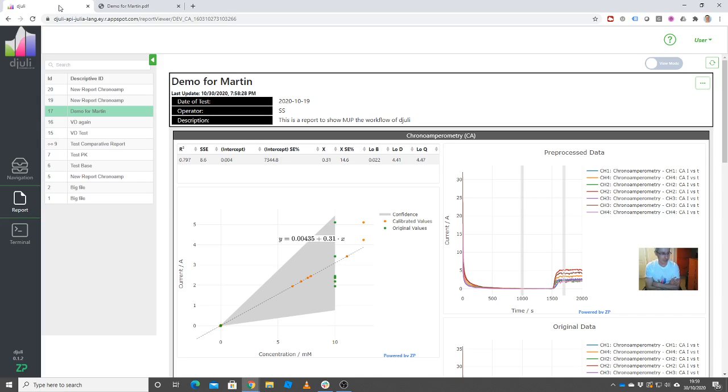So this is a really neat way of allowing you to upload your data, properly store it and categorize it, properly be able to process lots of data at the same time, and then get statistical results from not just one single experiment, but bring several experiments together and get the kind of statistical view on the entire data set.